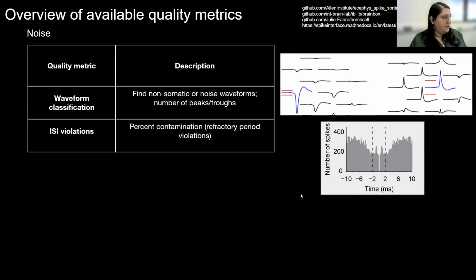Okay, so I'll start out, and I'm going to go through a list of some available quality metrics. This is an incomplete list. There are certainly other people who are using other quality metrics. At the end, I have a slide with all of the links, and I'll make that available to you, so you can look at all the documentation for all of these already computed metrics and see what makes sense for you.